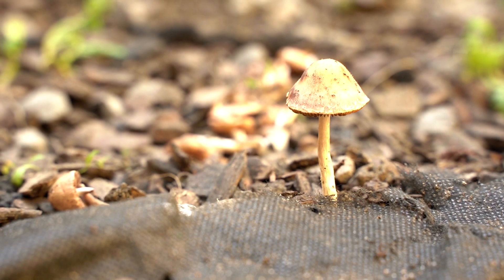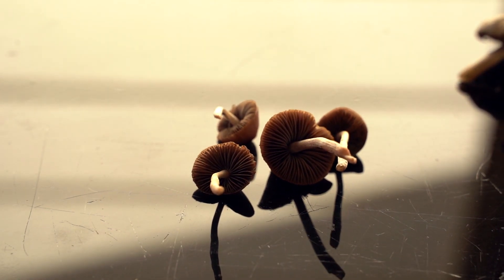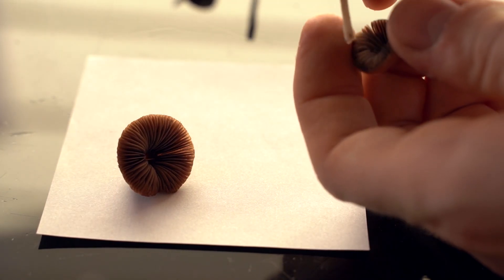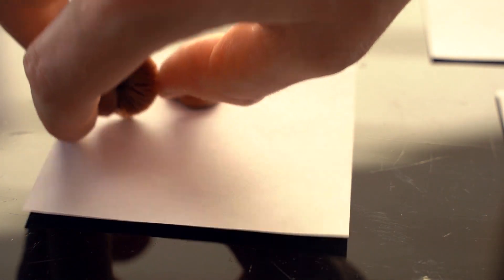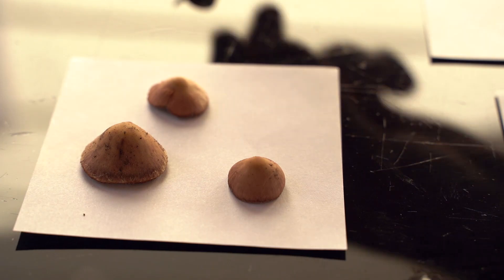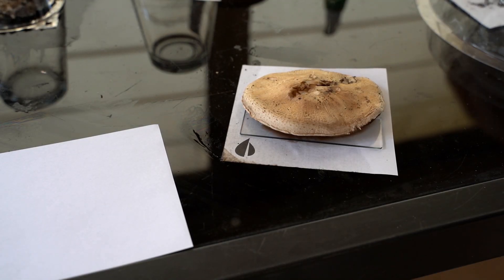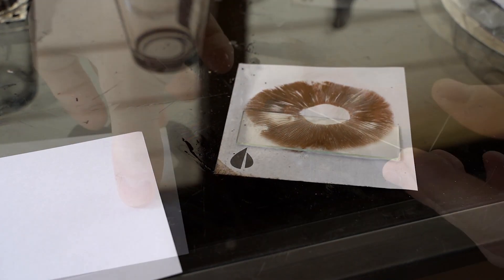With these mushrooms, the spores lie on the surface of the gills. Carefully remove the stem and place the cap with the gills facing down on a piece of aluminum foil, a white piece of paper, an index card, or a glass microscope slide. Mycologists often use glass slides, which allow for quick examination of spores under a microscope.